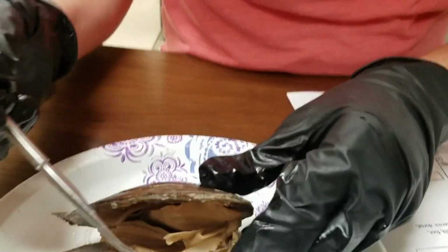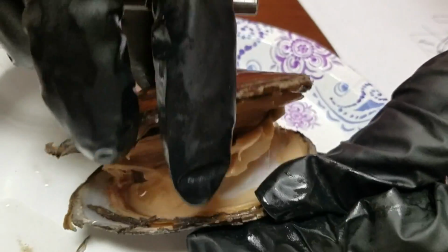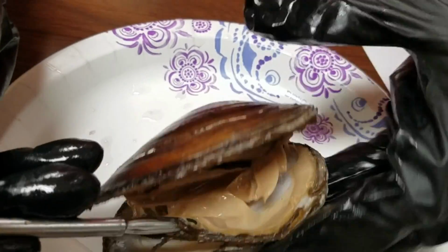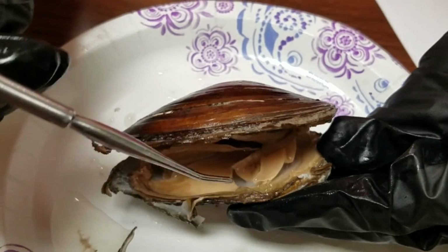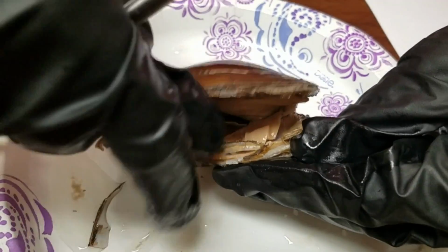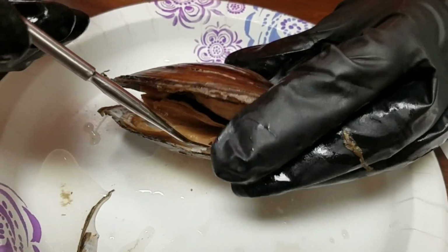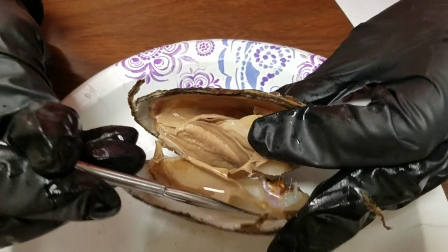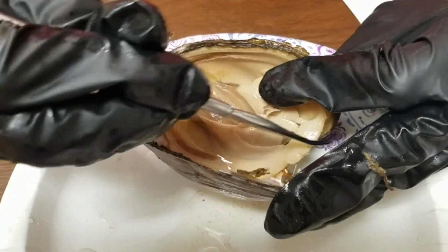And then you can see that there's some stuff that's tearing down here in my clam. That is the mantle. So I'm going to try and scrape. I'm going to try to keep the mantle in as one piece as I can. So I'm going to scrape along the edge here and try to keep, oh, that's some shell. There we go. I'm going to try to keep my mantle in one piece. Aha. Come on, you little guy. There we go. Okay.